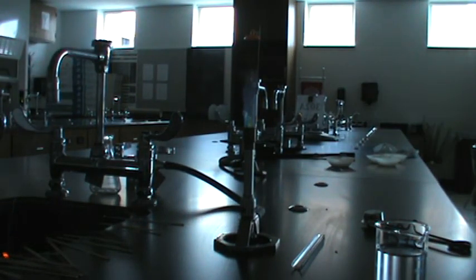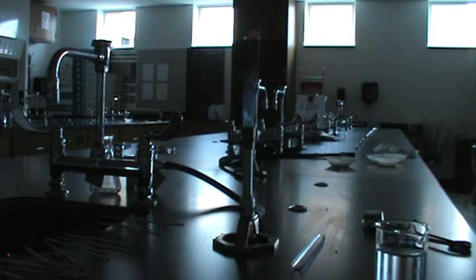Now, if you see the wooden splint burning, that's not the color of the flame, that's just the splint burning. And number 3. And that's a pretty color right there too.